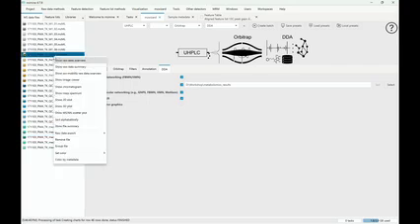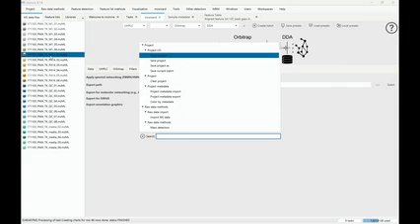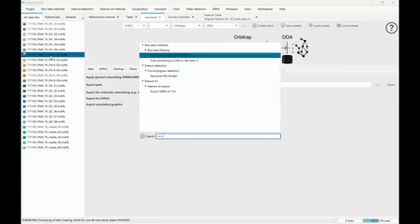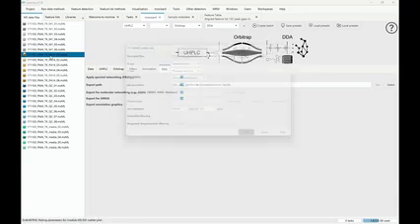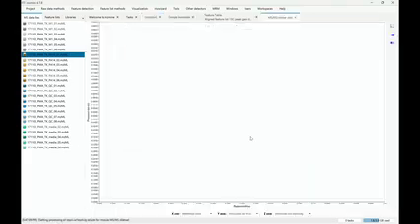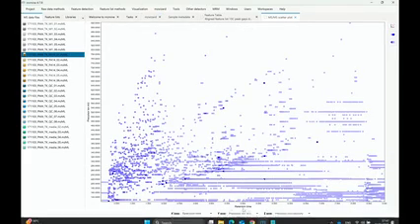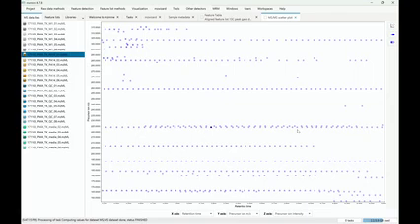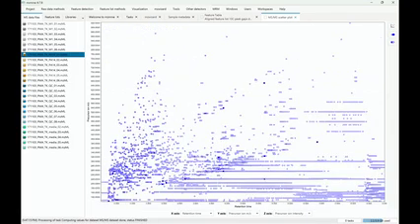There is some way where you can right-click or you can, again, search for the MS visualizer, scatter plot. Ah yeah, MSMS scatter plot. You see, I have to search myself. So you can go for the MSMS scatter plot, and it's actually, I think, a quite nice plot where you can just plot, let's say, the retention time and the precursor m/z of all the fragment scans that were triggered. It's also good quality control to see that there are some masses that were not excluded with a static exclusion list, and maybe the method could be improved here to also exclude those.